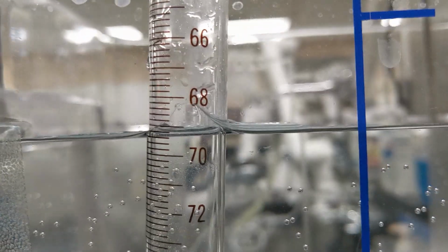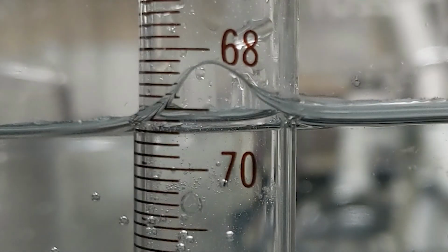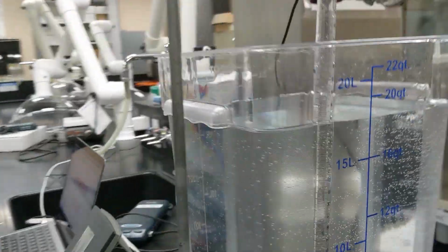We can get the measurement. And then we still have to measure a couple other things. We have to measure the temperature and the pressure in the room, which we'll look at in just a moment. Okay, that's good. Did you get a good volume reading? Yep, got it. Okay.